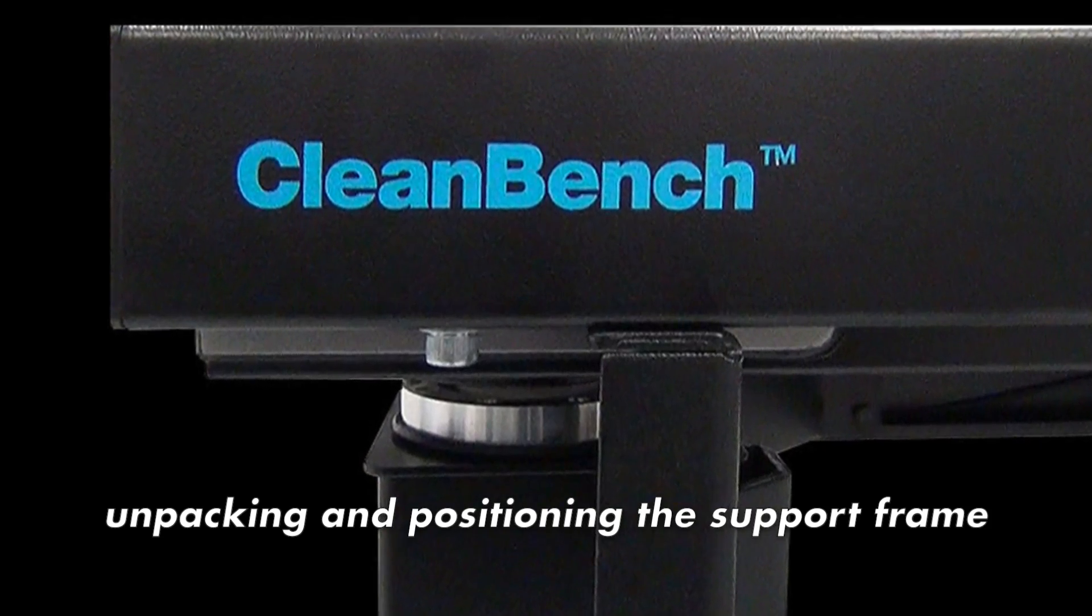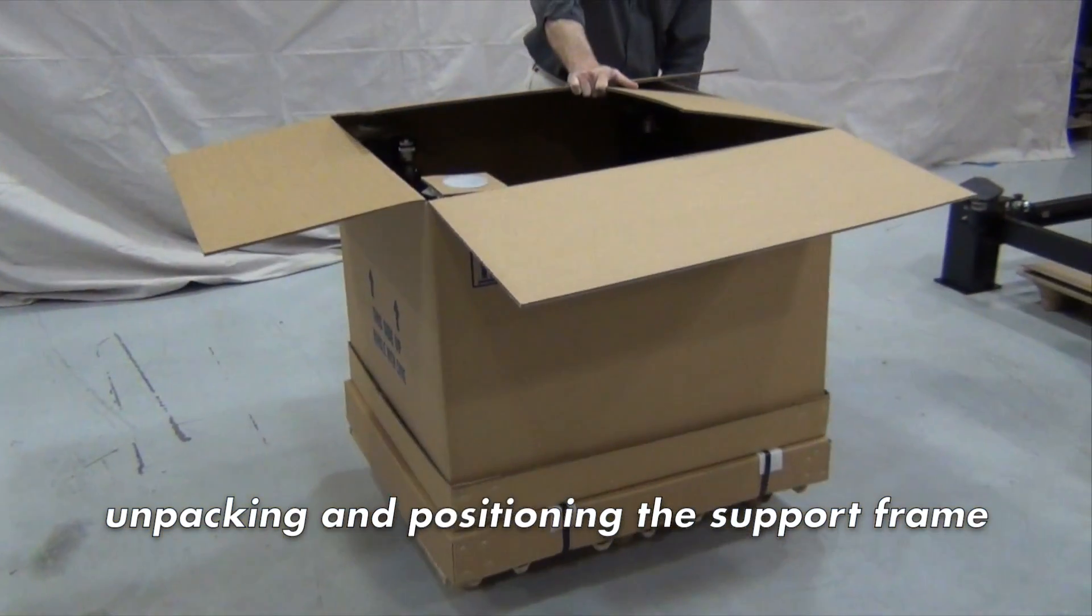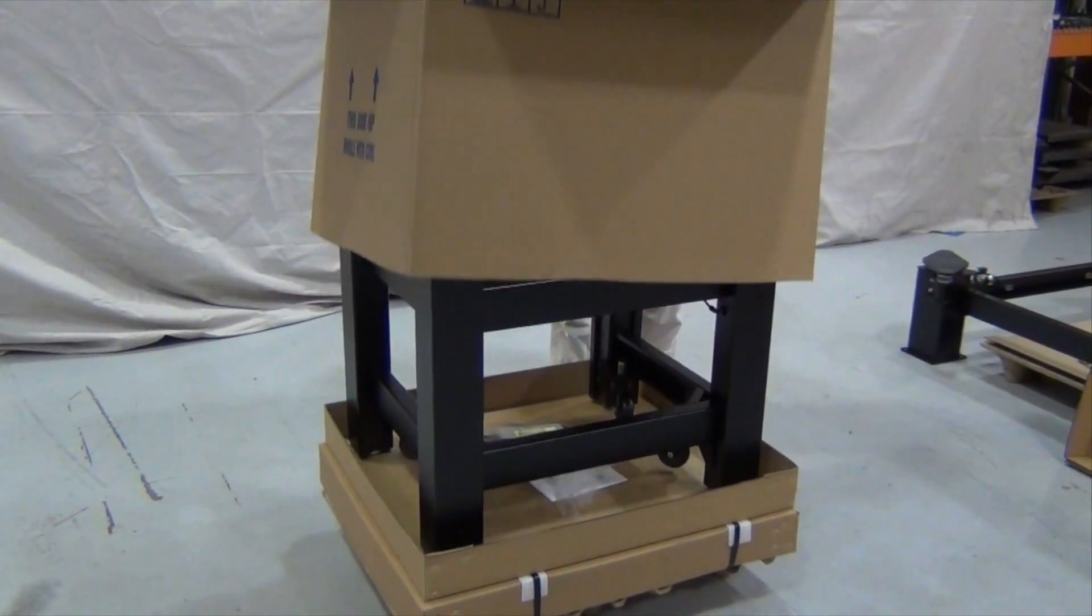Inside the box is a bag of hardware and any accessories included with the order, such as front support bars or armrest pads.